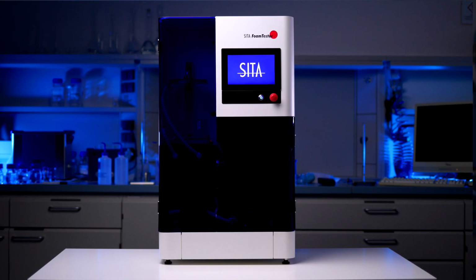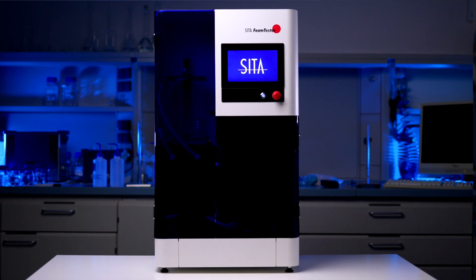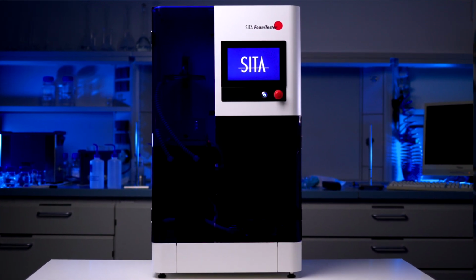With the PC software SITA Foam Lab, you are able to create and evaluate customizable test sequences conveniently in the office. Our foam tester is used wherever foams are desired, such as in cosmetics, or not desired, like in cleaning chemicals or cooling lubricants.